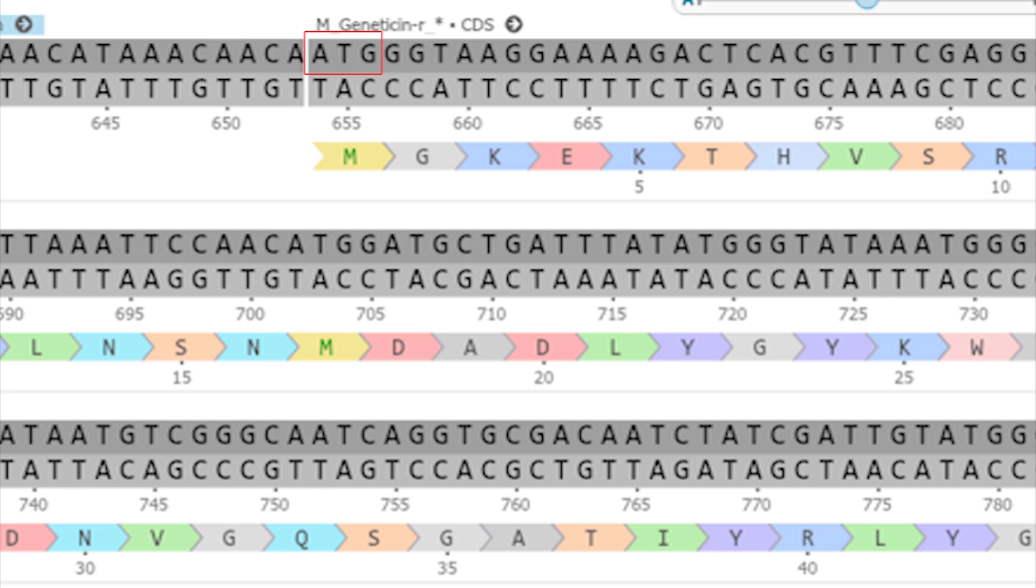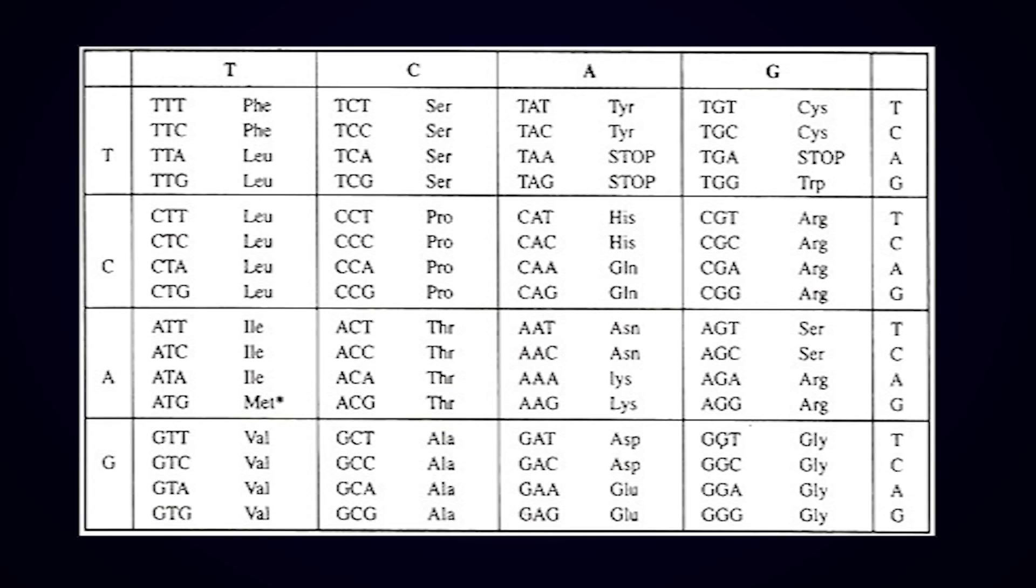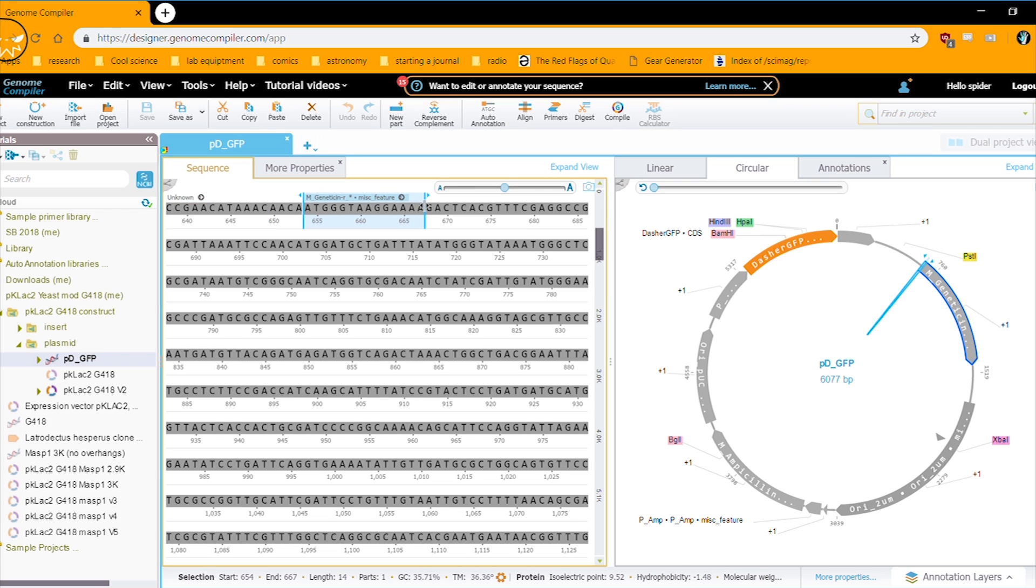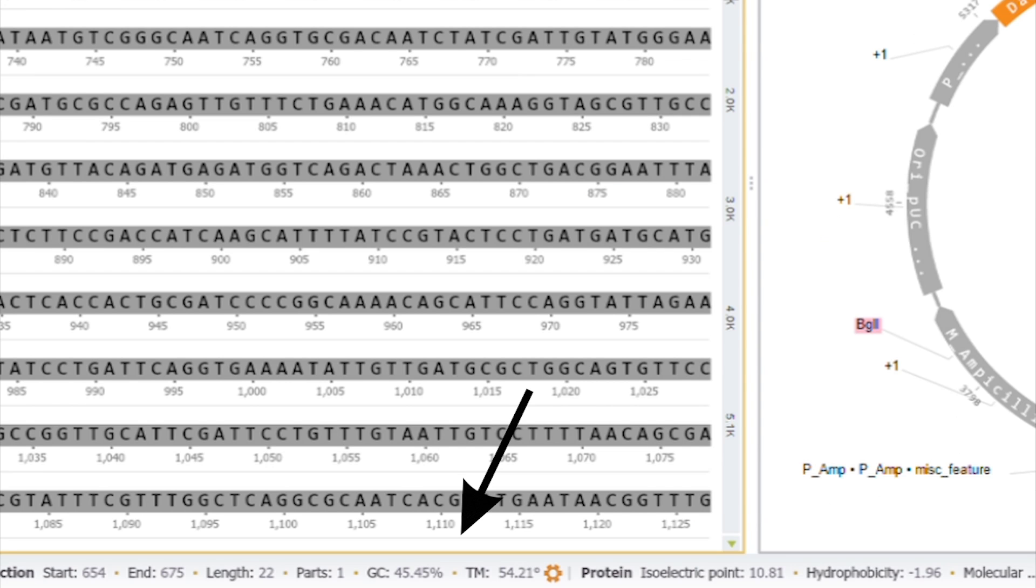The first thing to notice is these three letters, A-T-G. DNA is divided into three-letter segments called codons that code for different amino acids. Here Genome Compiler shows the amino acid sequence underneath. A-T-G codes for an amino acid called methionine, but methionine is also what's called the start codon. After the DNA is copied into RNA and the RNA is going to be translated into protein, A-T-G is always the spot where translation starts. So almost all proteins, at least when they're first made, start with a methionine. The point being is that this marks the start of the G418 resistance protein. So this is where we want to start our primer. Once we know that, we just highlight the sequence starting there and extend anywhere from 15 to 25 letters further.